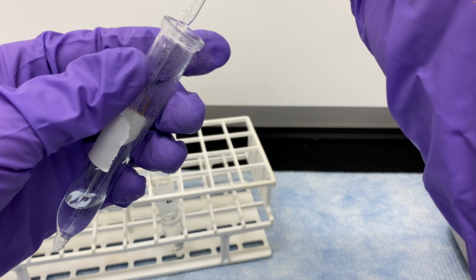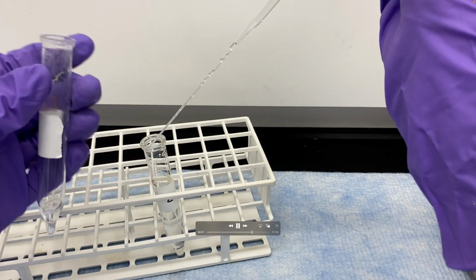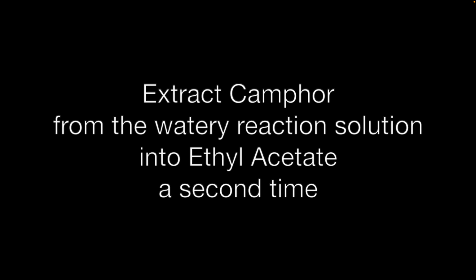One way you can make sure you only get the bottom layer is by pressing the tip, not pushing the tip, because the tips of these Pasteur pipettes can break very easily, but just pressing it gently against the bottom. When the Pasteur pipette is pressed against the bottom of a container, the liquid goes up into it much more slowly, so you can better control when you stop taking things up. And there, the water is removed, and you just have the ethyl acetate.